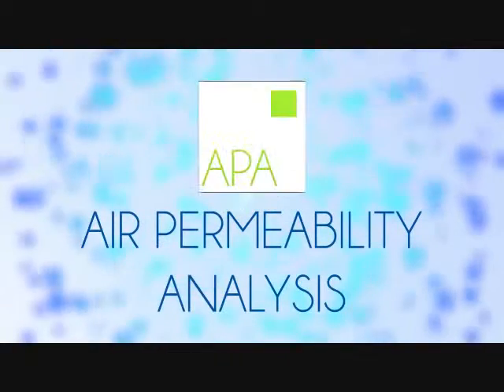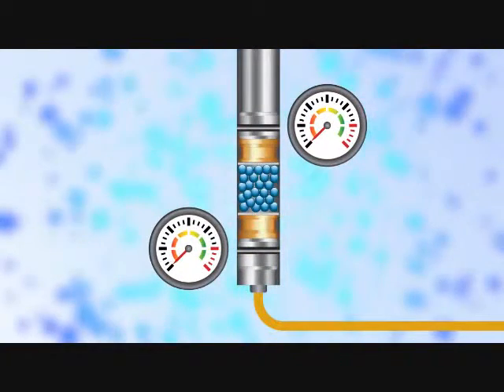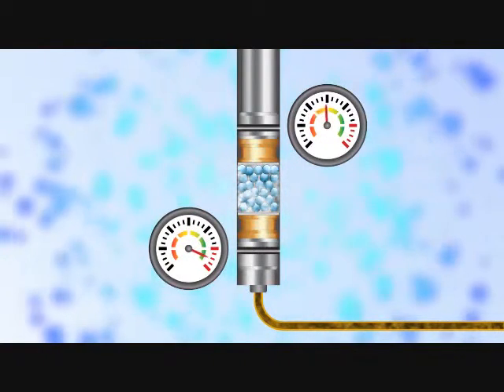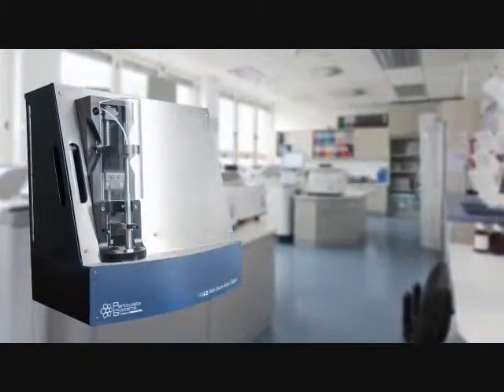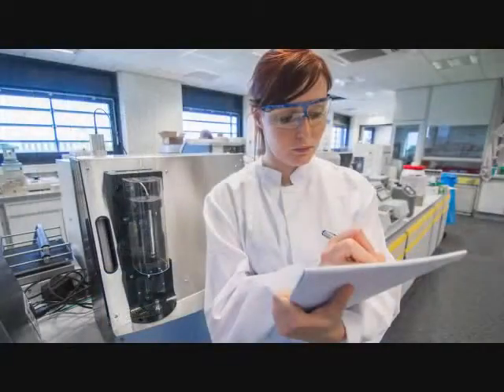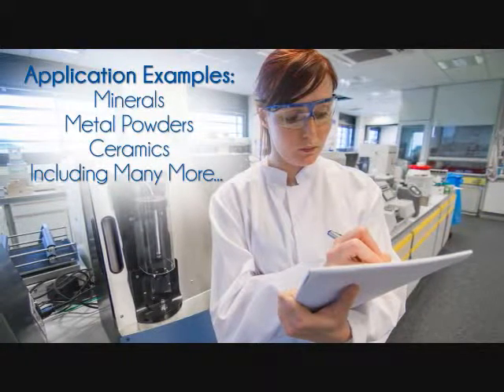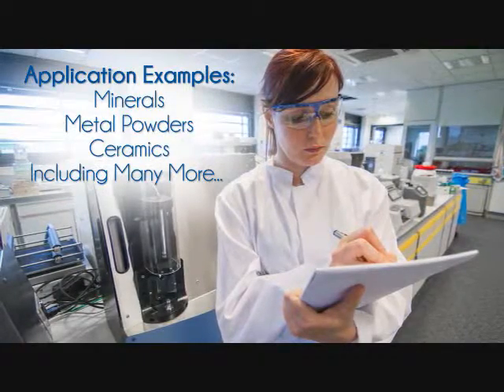Air permeability analysis. For particles or powders that have a high density, a particle size can be determined using air permeability analysis. This technique utilizes dual pressure transducers to measure pressure drops across a packed bed of powder. The Sub-Sieve Autosizer, or SAS, is a direct and improved successor to the widely used Fisher Model 95 Sub-Sieve Sizer. The SAS determines particle size by air permeability and reports an average size as well as a Fisher number.